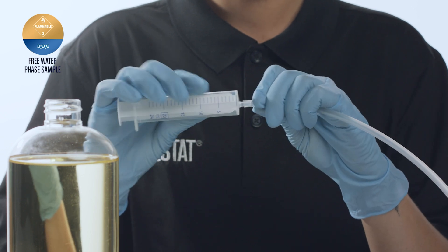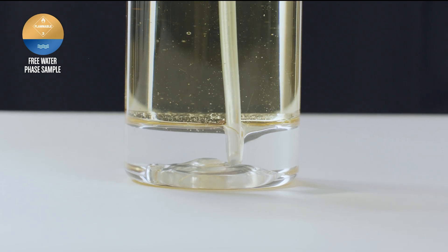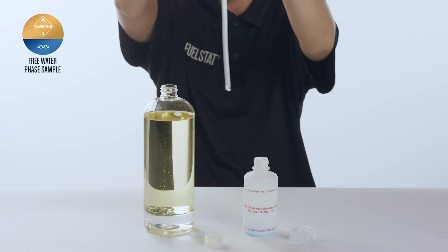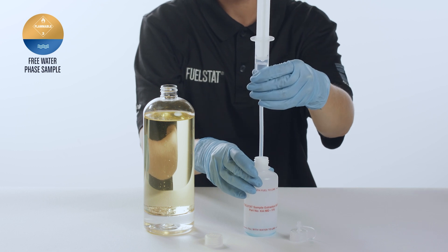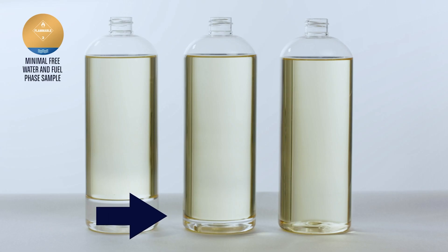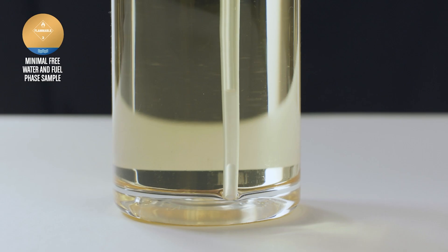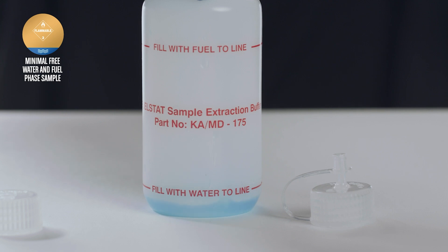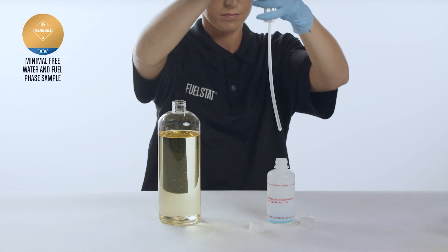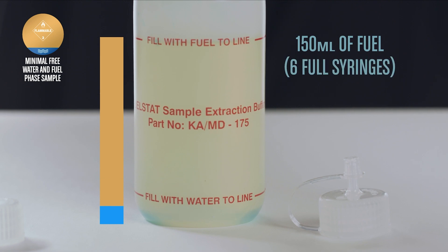Push the extraction tube onto the end of the syringe as shown, then use the syringe to extract 15 millilitres of free water from a fuel-water sample. Fill to the bottom water line of the test bottle. Where there is only minimal free water evident, do not worry if the water sample will not reach the bottom water line. Transfer the free water that can be seen into the test bottle, then reinsert the syringe to extract fuel from near the bottom of the sample to top up the test bottle to the top fuel line. You will require approximately 150 millilitres of fuel, which is 6 full syringe extractions.